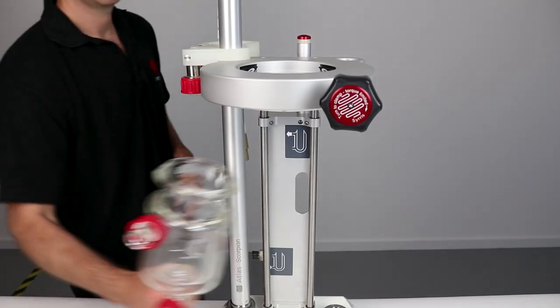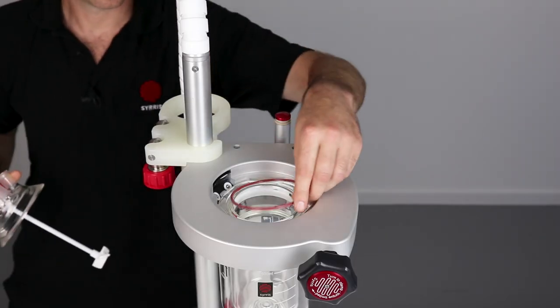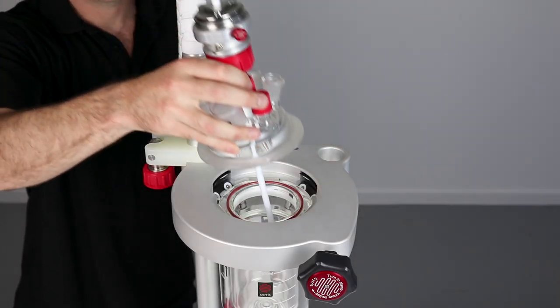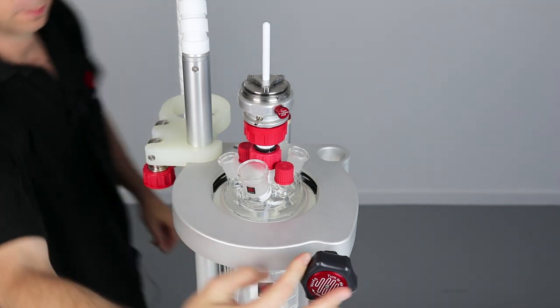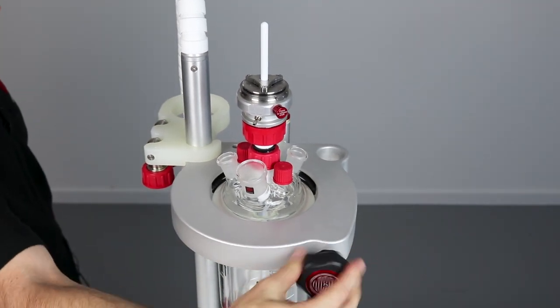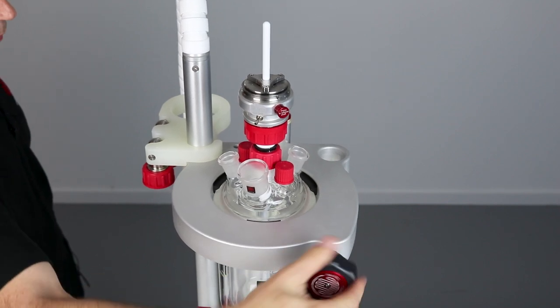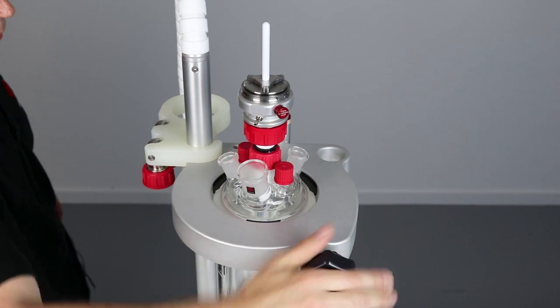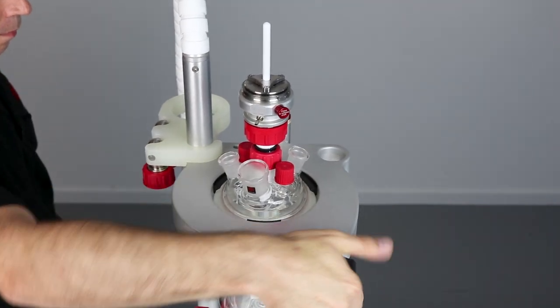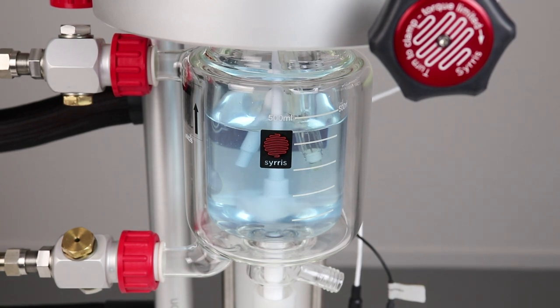All of our vessels across the entire product range have the same width to height ratio or LD ratio and use geometries based on manufacturing scale reactors for structural integrity performance and seamless scalability from your lab scale experiments to pilot plant. Each vessel features a spring-loaded bottom outlet valve meaning that even at the extremes of temperature your vessel will remain firmly sealed while protecting your glassware in the event of any glass expansion or contraction. And as our vessels are made in-house vessels can be customized to fit your exact needs.